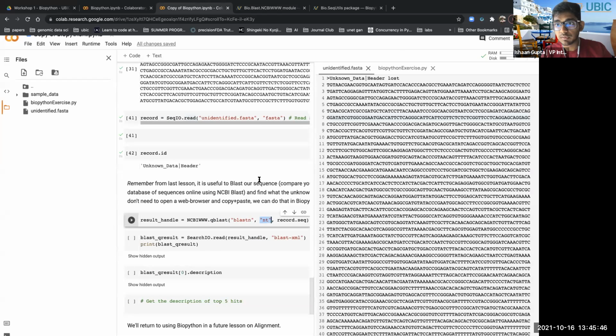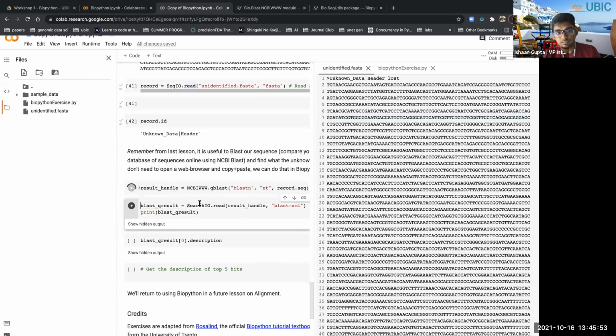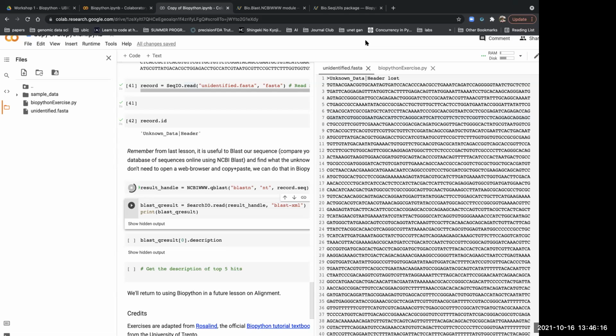All righty. Let's run this then. It's going to take some time, so you should run it now. Right, so does everyone have this running right now? Yeah, I'm blasting. Blasting, nice.